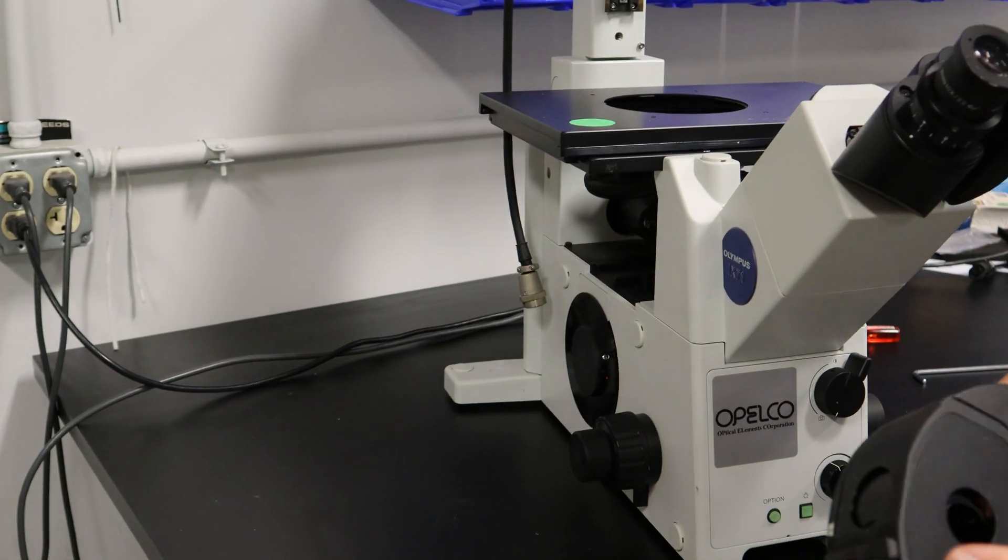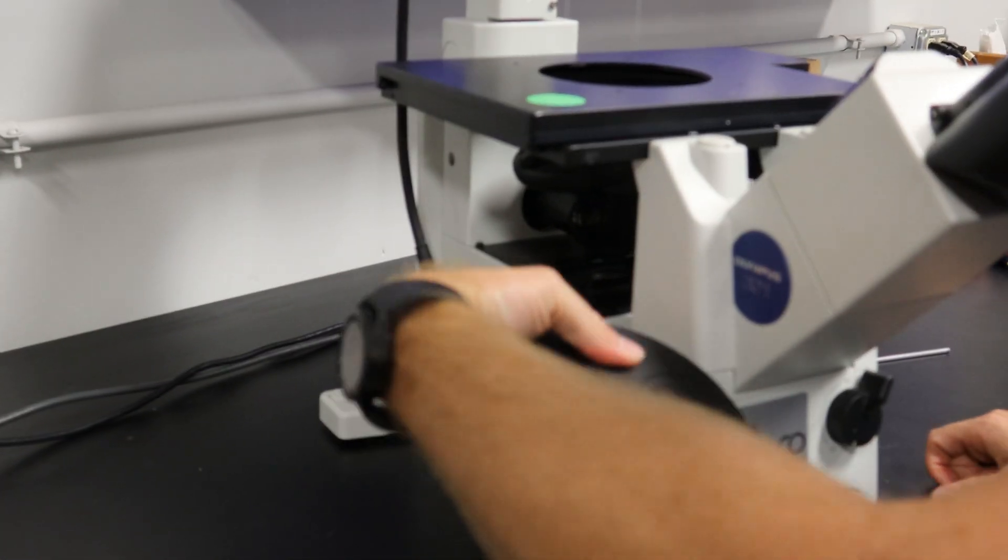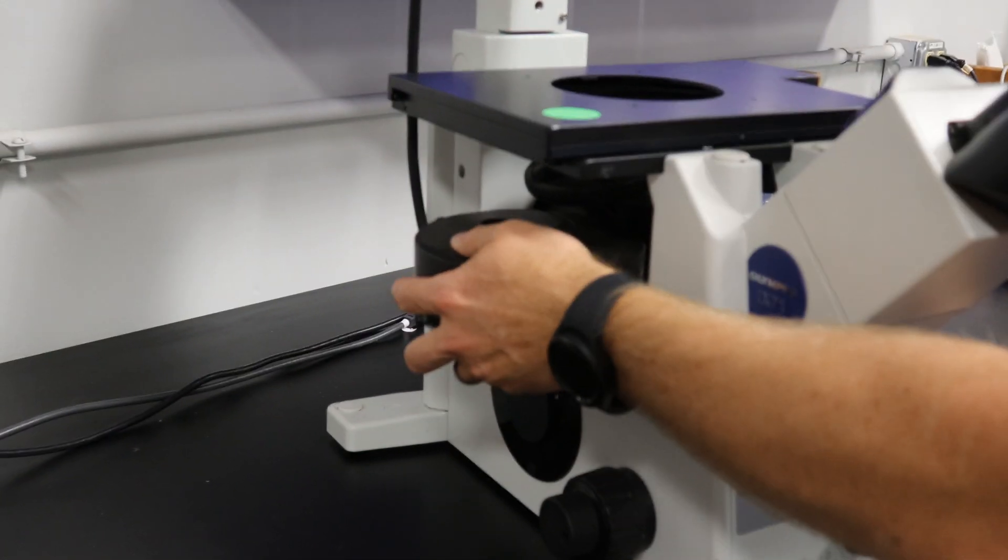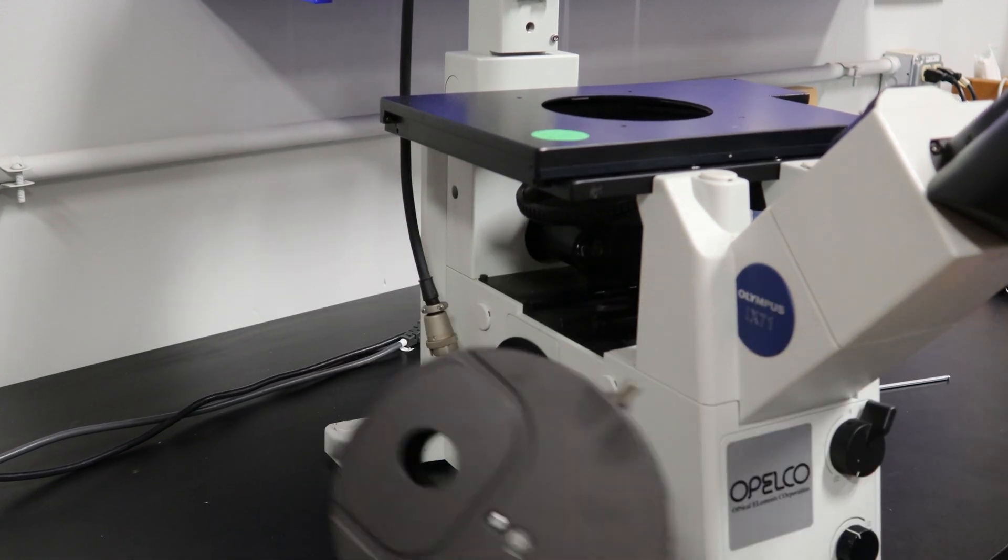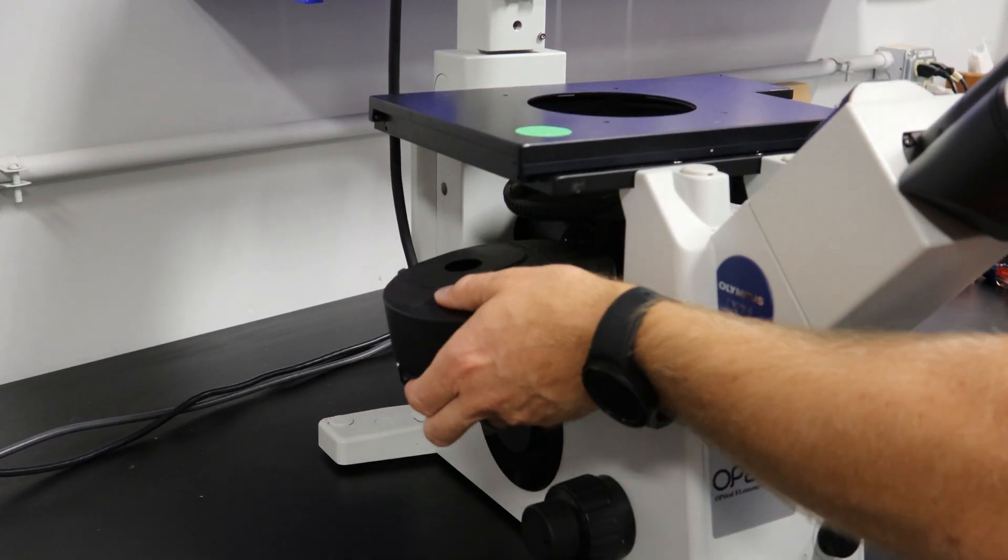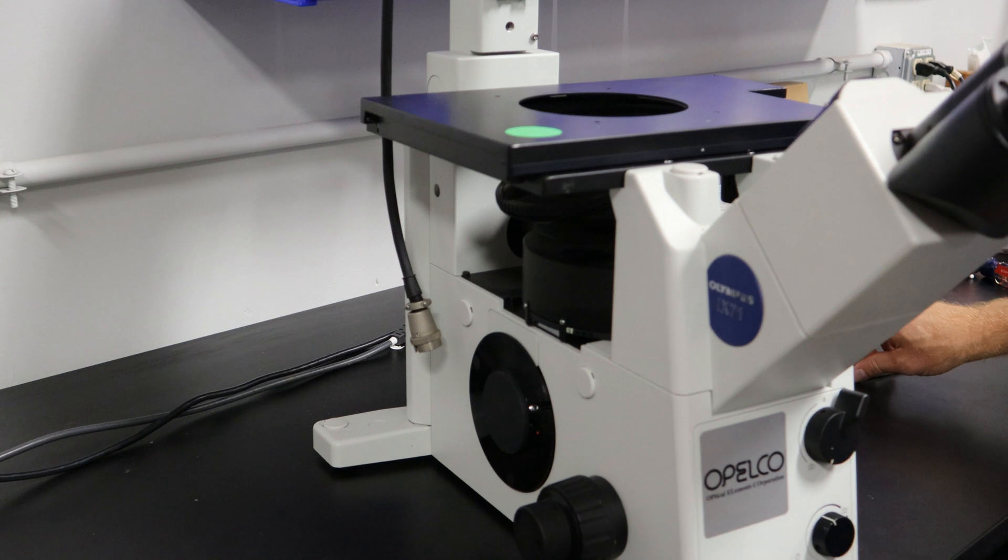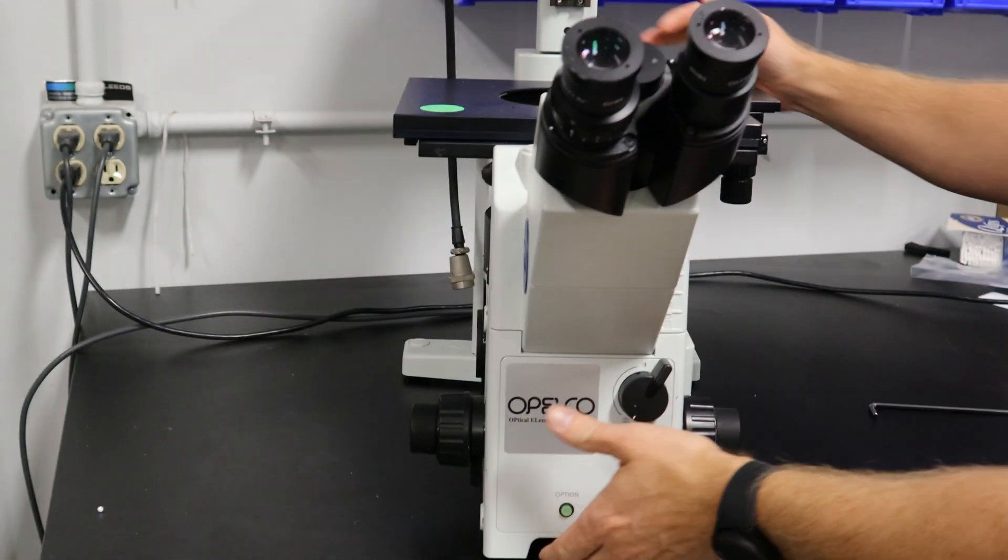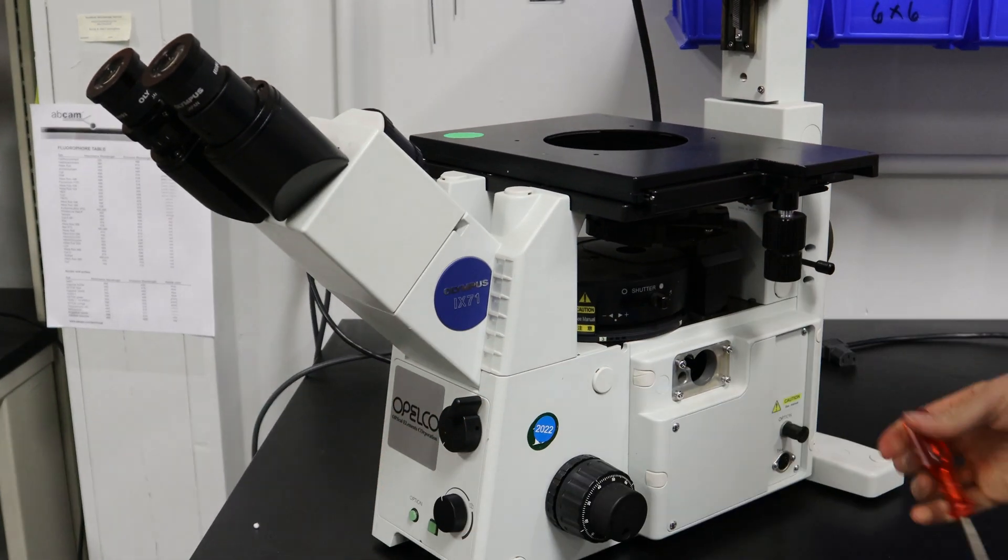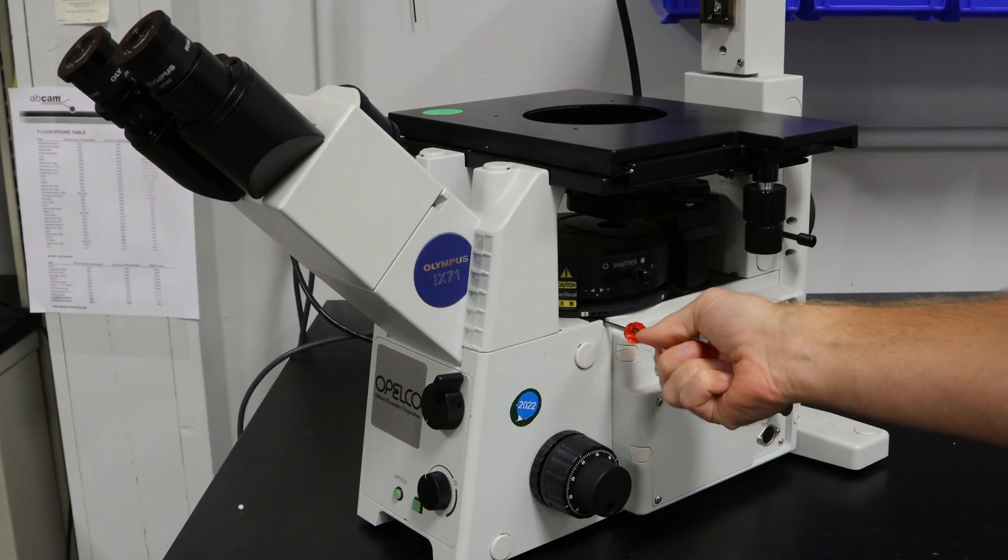The fluorescent turret will slide in right here on this dovetail. Make sure not to rotate it. Then you want to lock it in right here with a three millimeter Allen wrench on this side.